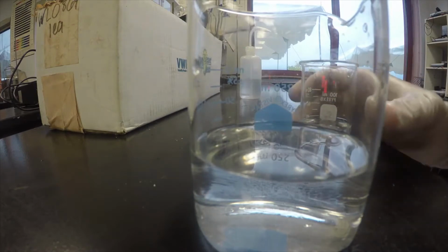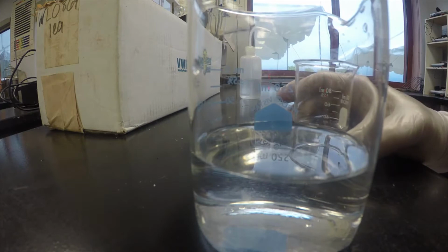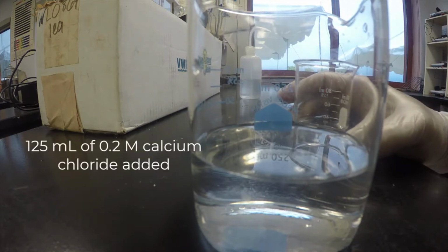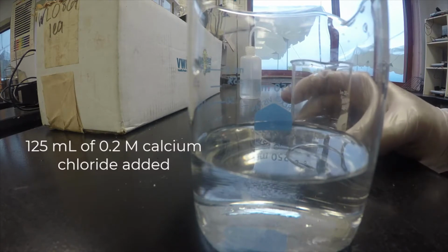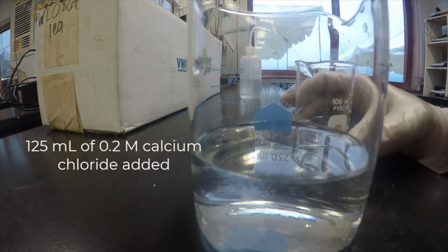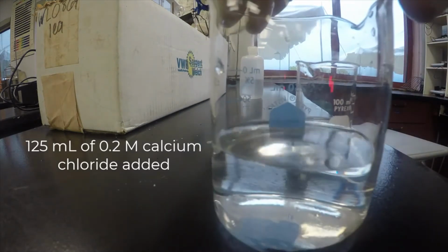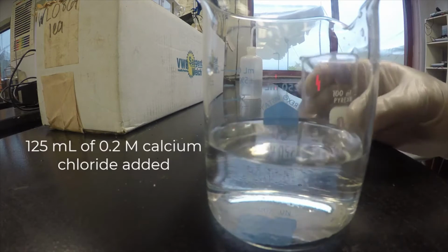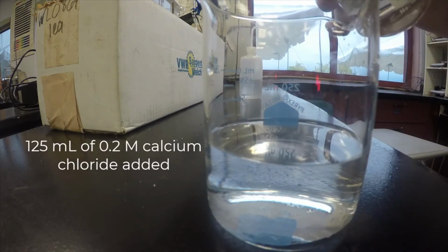Okay, the next step is to add about 125 milliliters of 0.2 molar calcium chloride to my solution of the group 1 metal carbonate. I've changed my perspective here simply to show you what the precipitation reaction looks like. So I'm going to slowly pour this.